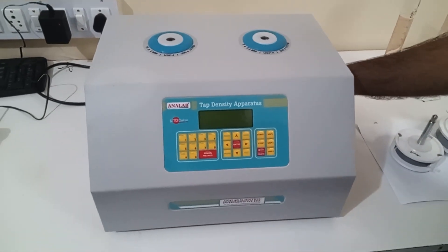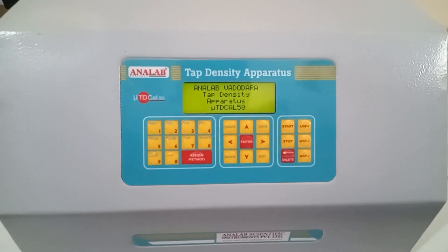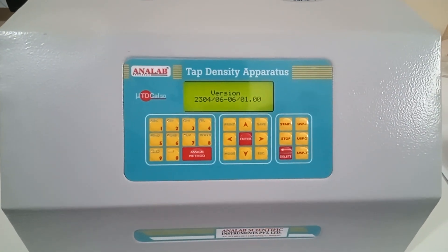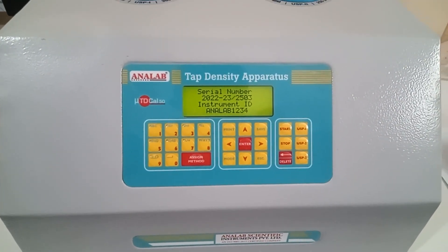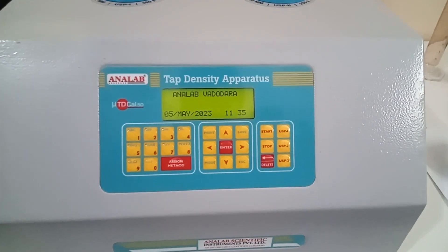So let's start with the power on of the instrument. We will switch on the instrument and then the instrument will show the manufacturer name, make, model, version number, its serial number and instrument ID. This will be the home screen for the instrument.